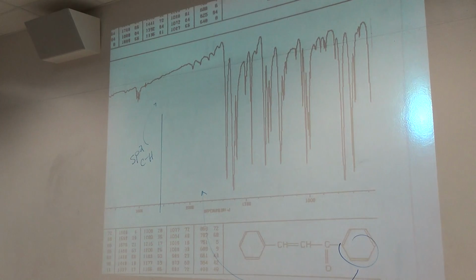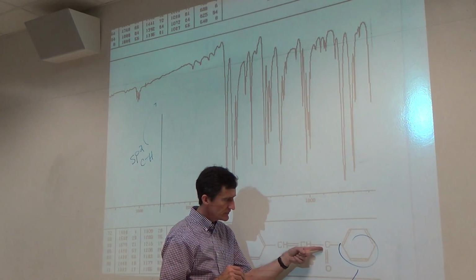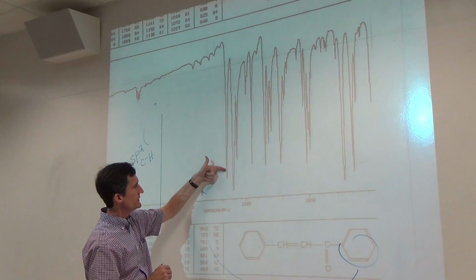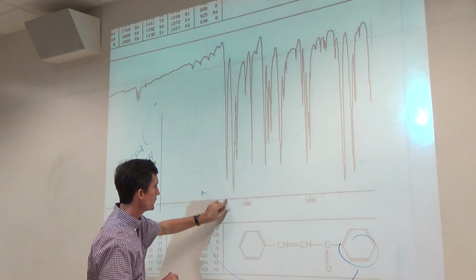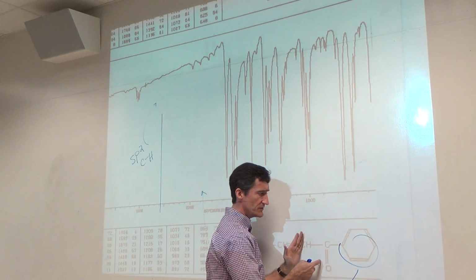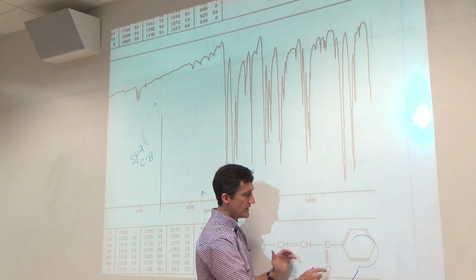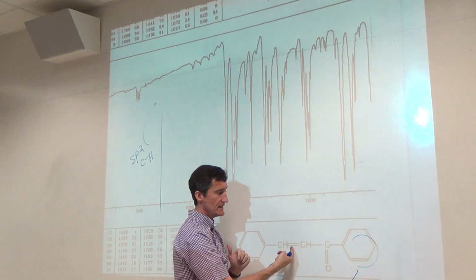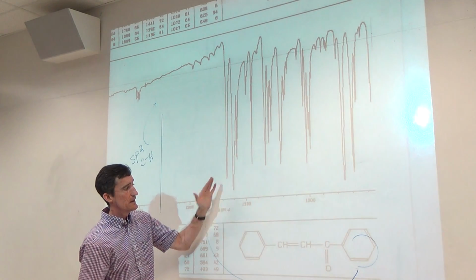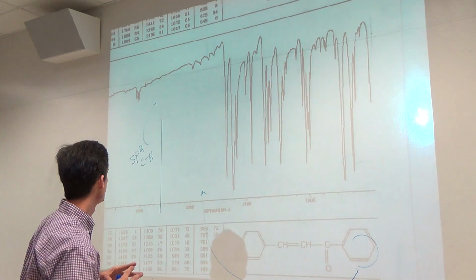The compound below is really just the miscellaneous one. The main point of it is that you'll notice that the carbonyl is pretty low. It's also not the strongest peak there. That's actually stronger. The carbonyl is more like about 1670, 1680. That's because it's conjugated not only by the aromatic ring over here, because there's a p orbital there, it's also conjugated by the alkene. So it's doubly conjugated, and this lowers the carbonyl below 1700 into about 1680.